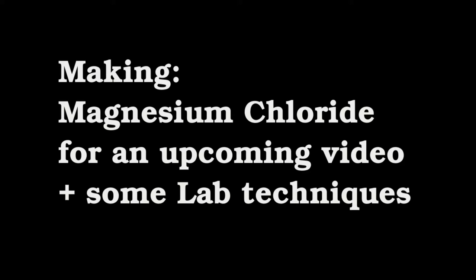Hi, in this video I'll be making magnesium chloride from magnesium metal and hydrochloric acid.